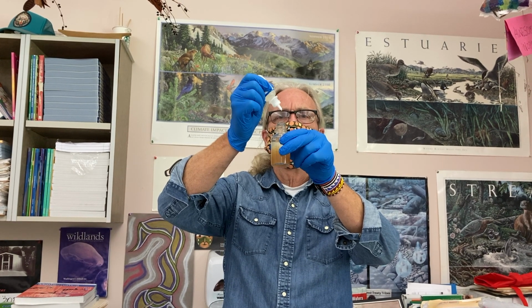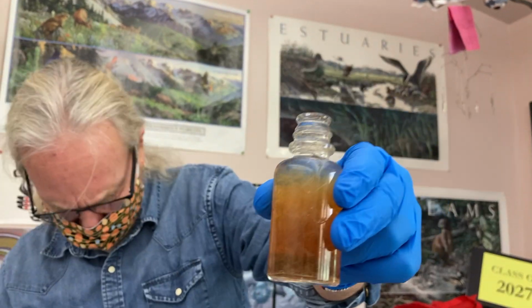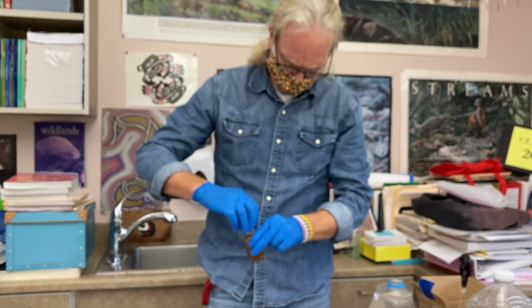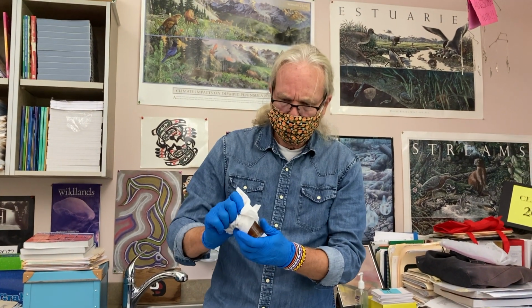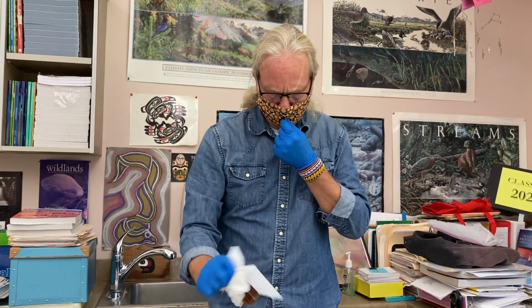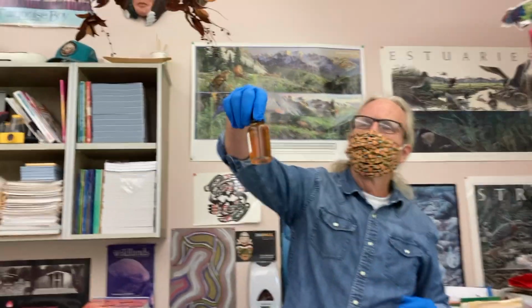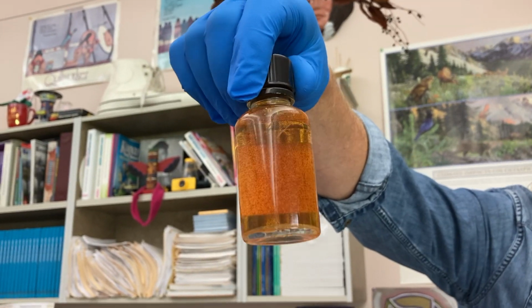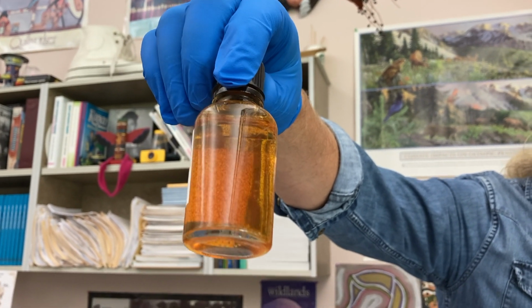1, 2, 3. Okay, again, something's happening. Something's going on there. And remember, you don't want to get any of these chemicals on your body. That's why I'm covering it, because there's a little seepage every time you add drops. It's getting a little yellow. You probably can't see it, but there's little dots in there still. We want those to dissolve as best we can. So we'll give it a second here.